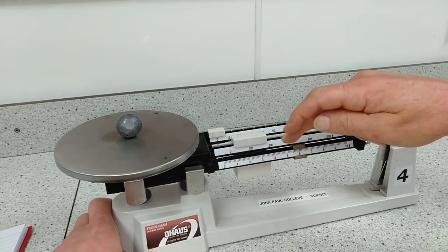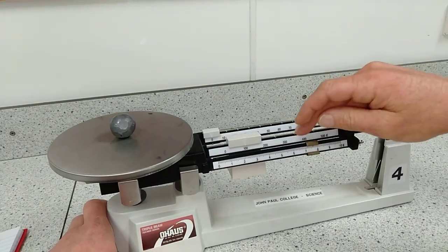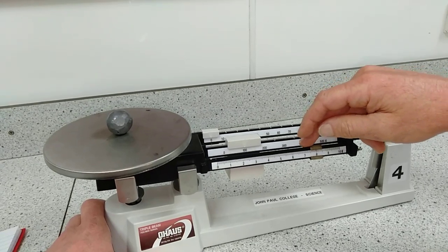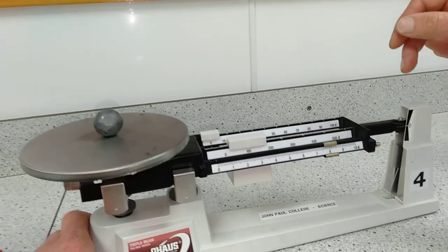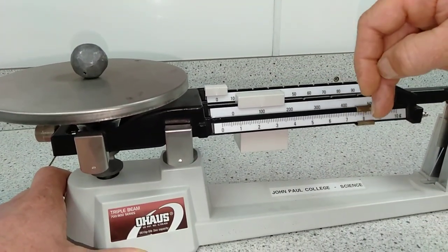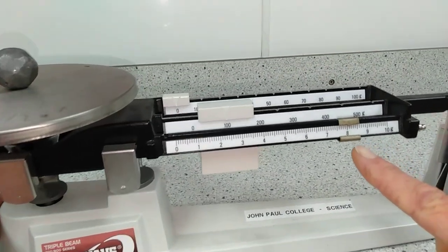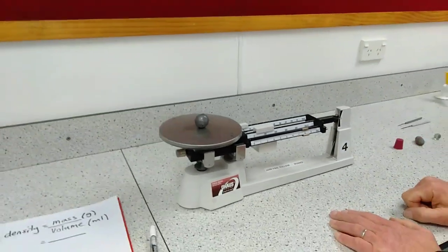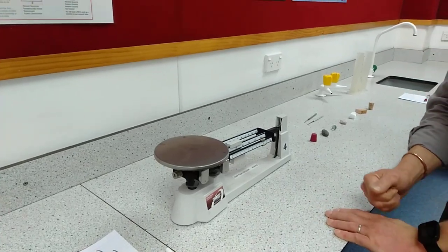We still don't have it balancing down to 0. 0 indicates that it's balanced. We just keep adding a little bit more, and we get to about a value of 100, no tens, 8 units, so it's 108 units. Once we have a mass, we have something we can write down in our results.